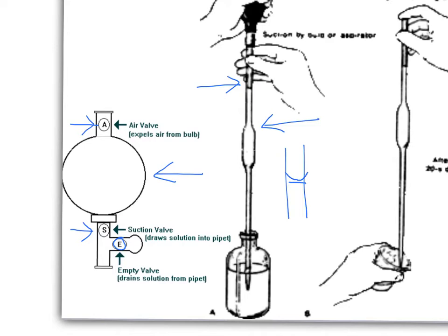You start off by expelling air from the bulb. So you squeeze at A with your fingers, you pinch your fingers together at A and you squish in the bulb and the air will come out of it and it will be like a sucked out balloon.